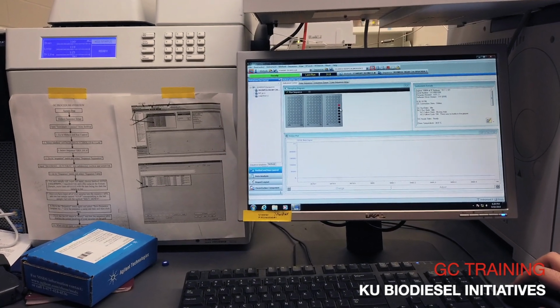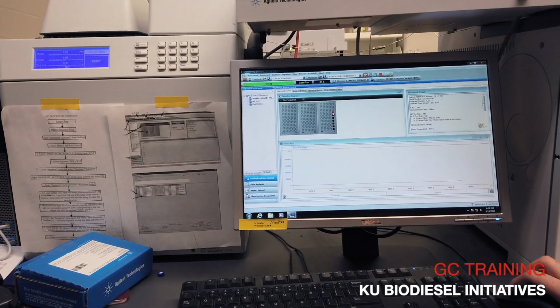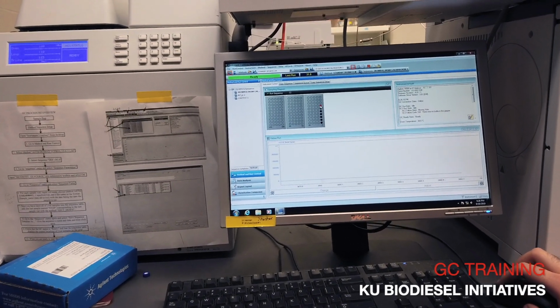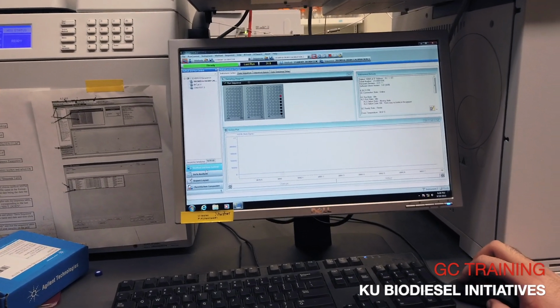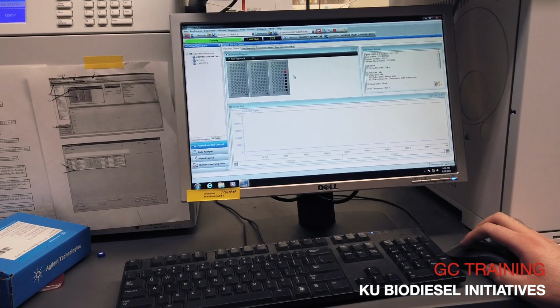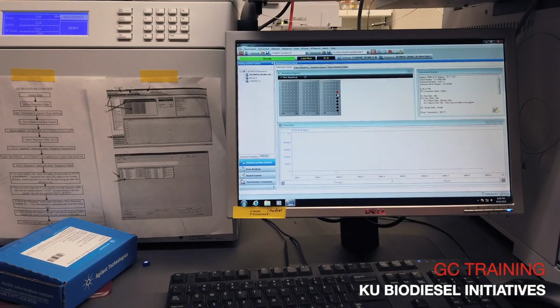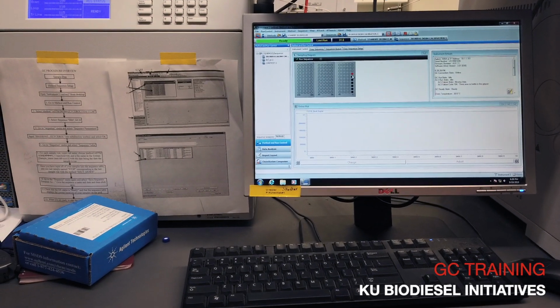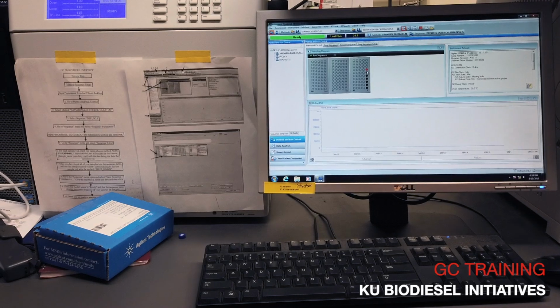What's that red one? It's saying that it didn't hit. Well, was that the one that was empty? Didn't we have a blank? Ah, that's right. Oh, okay. I didn't think it would actually take a vial. Whatever, that's fine. That's the one that was supposed to be shut down, so that's okay.